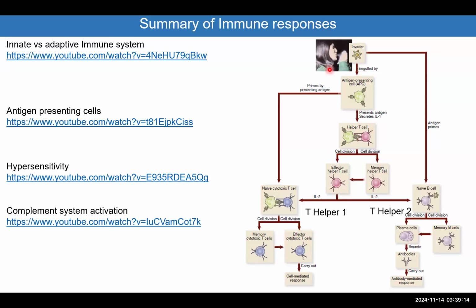So in labs, if I'm studying a protein, not really related to viruses, any protein, and I want to check the levels of that protein, I need to generate an antibody that is specific to that protein. So I will need the DNA sequence, the RNA sequence, the amino acid sequence. I would do comparison between many proteins to make sure that this is the best antigen or sequence from that protein that I will use to generate an antibody. And then I will generate the antibody.